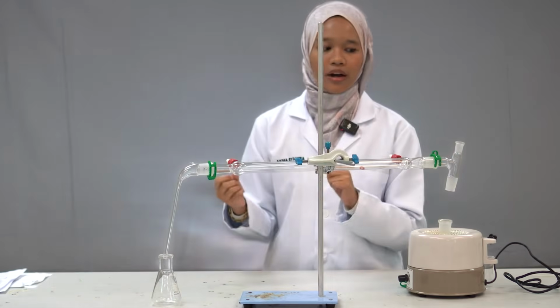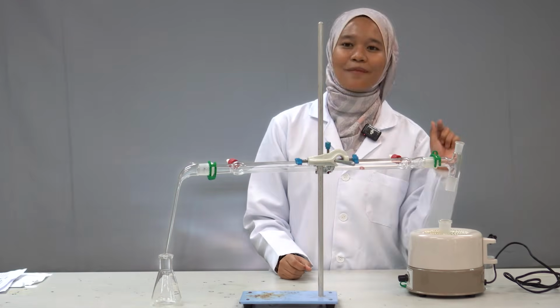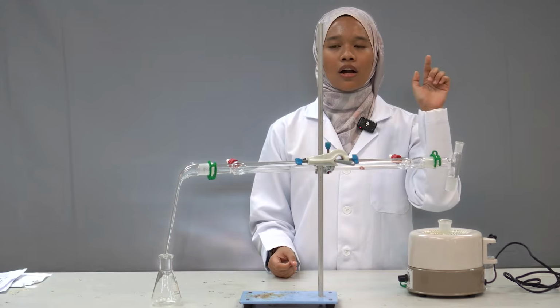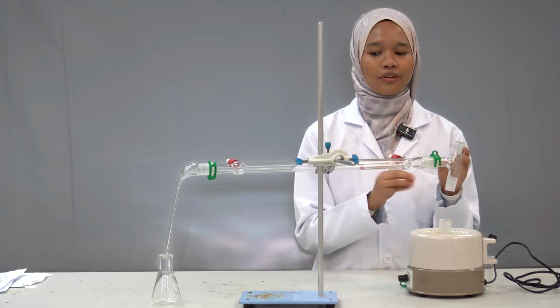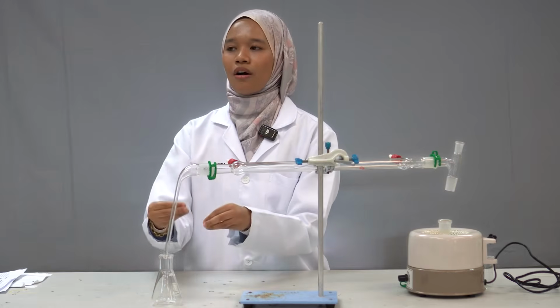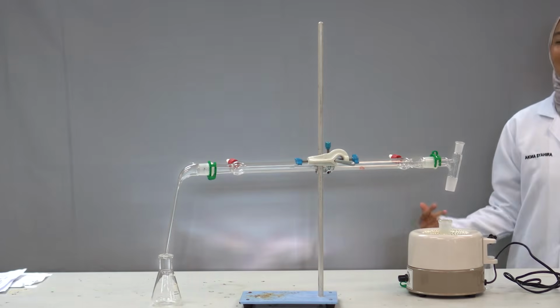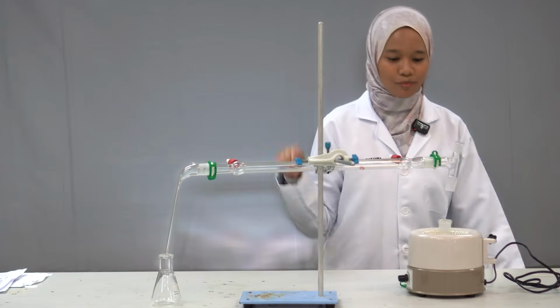Why is DCM the product? Because between DCM and the basic solution, DCM has a lower boiling point, which is 40 degrees Celsius. So the DCM will vaporize first, and we will get the product of pure DCM. That's all from me. I will call Sister Iffah to tell more about precaution steps, safety, and a recap of the procedure of this process.